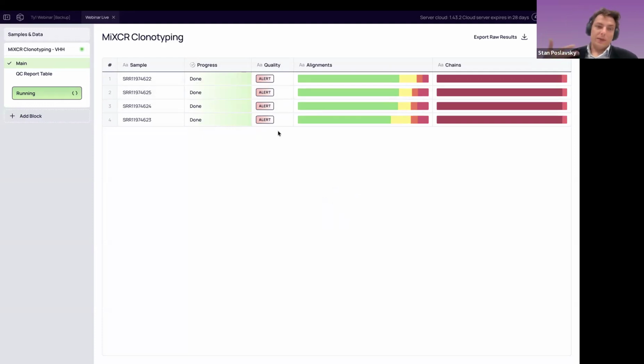One of the features is that if some files were already processed, let's say by your team member, then if you use the same files, the results will be reconstructed immediately. That's what you see here. The actual analysis of this data should take about 1 hour, more or less, on this scale. But since I already processed it yesterday when preparing for this webinar, the results appeared immediately. In a normal case, you will see the progress, etc.